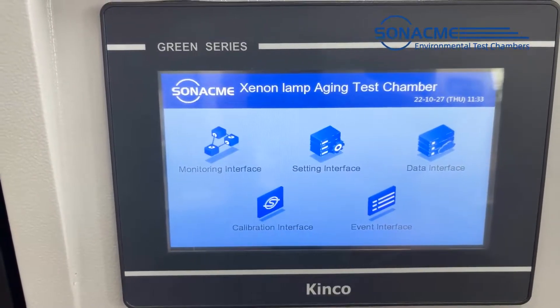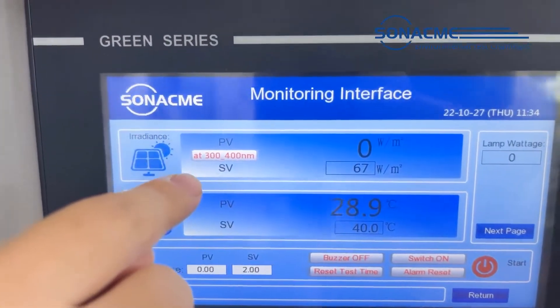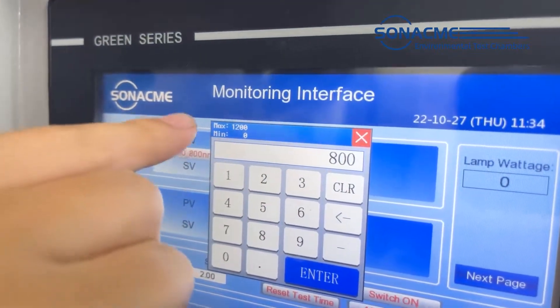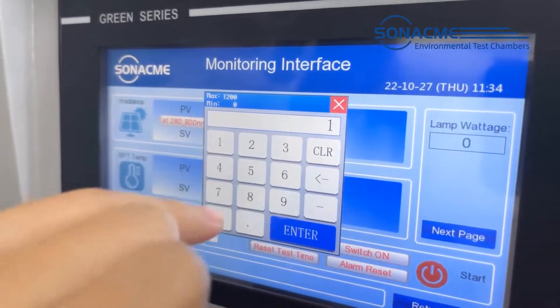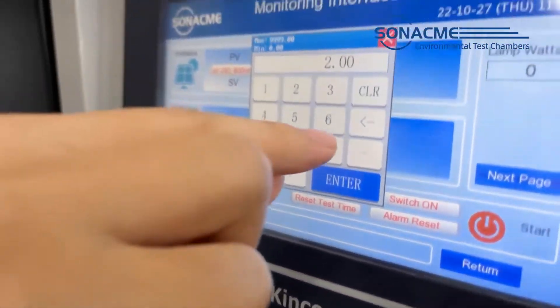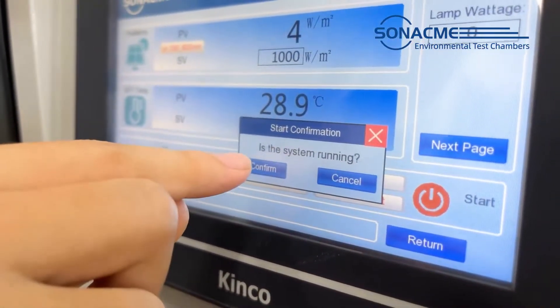Now back to the setting interface. The first one we see is the monitoring interface. We can select different wavelengths with different irradiance ranges. Then we set the irradiance — the maximum is 1,200, so we set 1,000. Enter the value. The next step is to set the test time, like 5 hours. Enter. Then click the start button and confirm to run the machine.